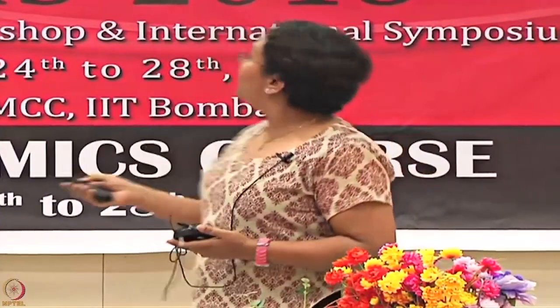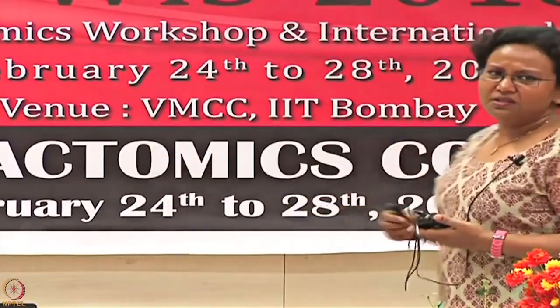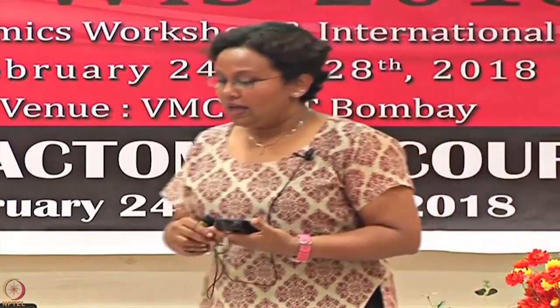If required, for example, if you do not see any rise in pH 5.5 and 5 and suddenly you see a rise at pH 4.5, that's where you go into a lower pH like 4.5 or 4. Otherwise, stay close to a more comfortable environment. Does it make sense? Okay.